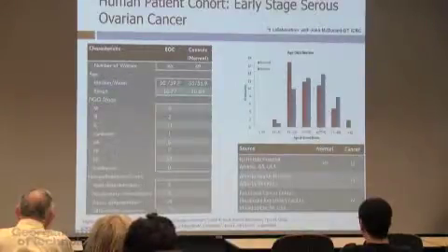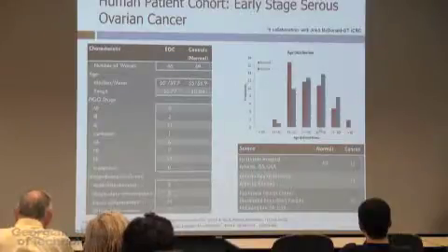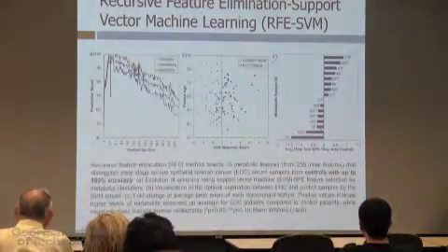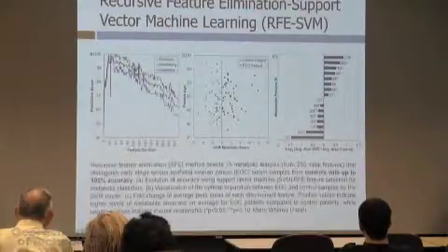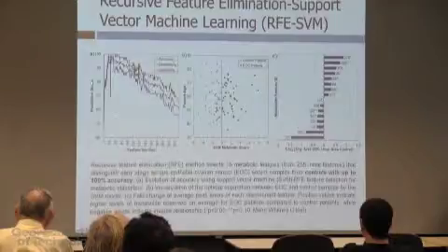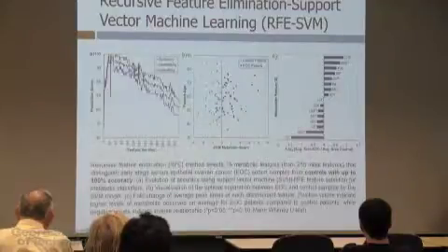Okay, so this is details on the age distribution. I'm going to save you all the details, but we did a very similar experiment to what I showed you for mice. We did all the metabolomics platform. And I'm also going to show you the negative ion mode data, although we also did other types of data. And it works. Okay, it works very well. If you look at all the metabolites, all the features, it doesn't work very well. This plot here, which is the most important, shows you the number of features that we are using, and this is the percent accuracy. If you use all metabolites detected, the specificity and sensitivity are 60%, which is close to flipping a coin. That's not going to work.